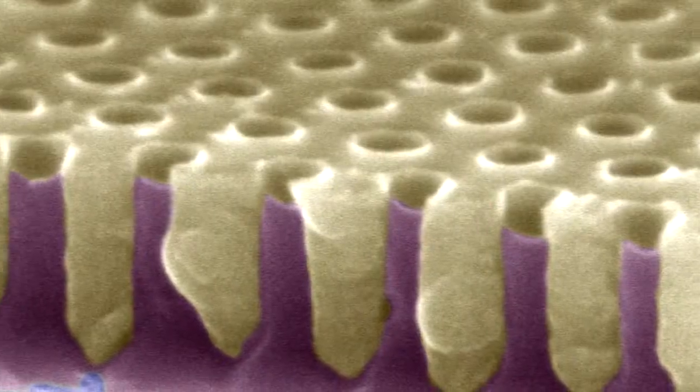We can really understand very deeply how materials are made. Sometimes people are looking at plastics or biological materials, so we have one instrument that's dedicated to that.